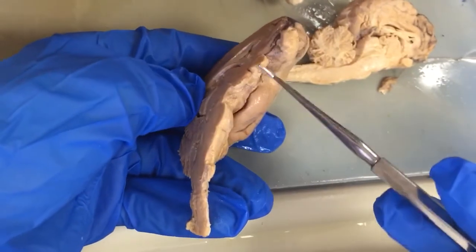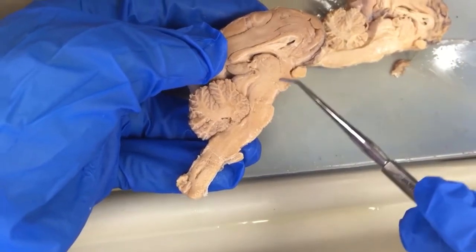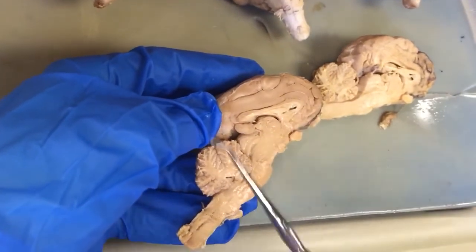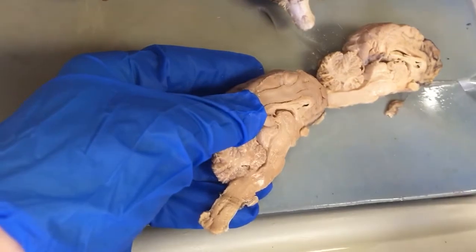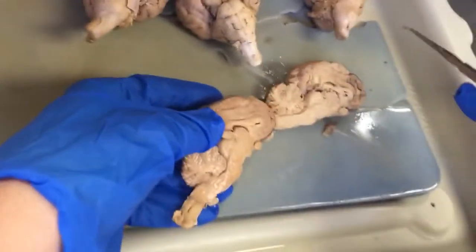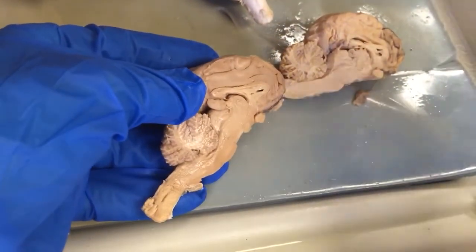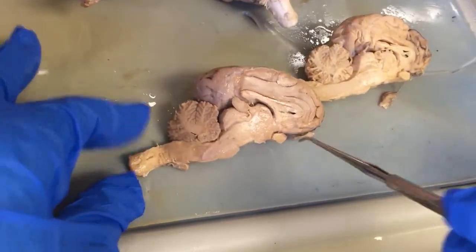Now, it also labels your optic chiasma here and your mammillary bodies in the side view, right? But those could be labeled in the medial view on the exam, but on a medial view like this I'm more likely to ask you the structures that you can only see in the medial view. I feel like you can get a better view of the mammillary bodies in the ventral view. The optic chiasma you can see better in the ventral view. Same for the cerebral peduncle, the pons, medulla oblongata. So it's helpful to know where those are, but I'm going to label those in the ventral view where you can see the entire structure, okay? But just for reference so you know where we're at.